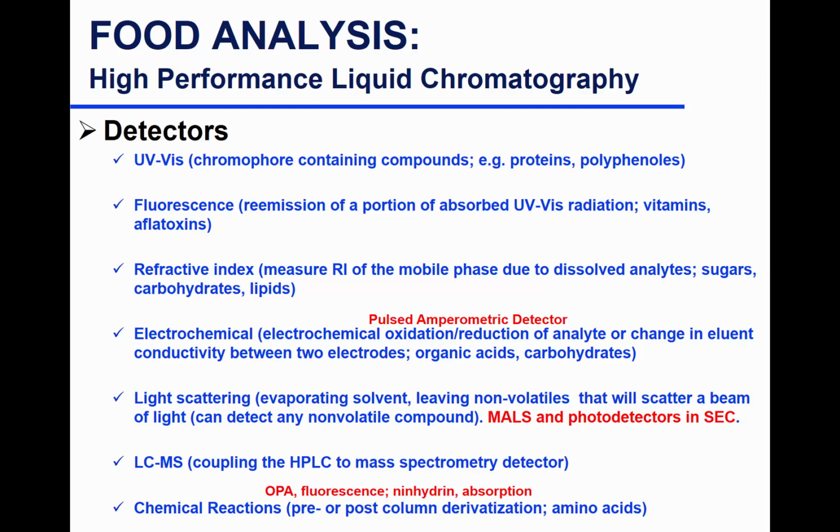But I'm assuming that since you've done the lab and we talked a lot about UV detection in the lab and last lecture, we're good there. I'm going to move on after UV. There is another detector that is based on absorption of light, but in this case, fluorescing of the light. After absorption, some compounds can fluoresce.